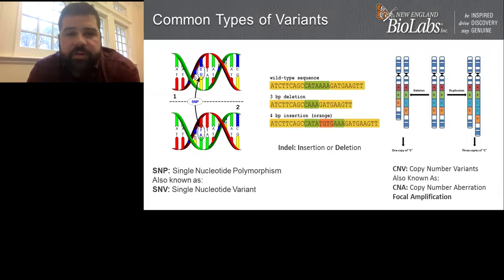For example, copy number variant detection is relatively easy to do with whole genome sequencing and even whole exome sequencing. But you need to understand the baseline performance of these variants, in terms of correlating the number of reads present for a given sample to a given phenotype. Understanding that variation is important. So whether or not a target enrichment panel has markers present to look at the baseline across the genome, and not just a focused event that might be present. Copy number variants, also known as copy number aberrations, and a focal amplification is a common type of CNV that's detected in many of these studies.